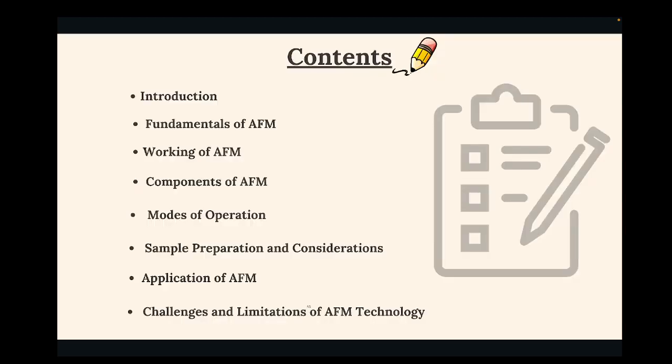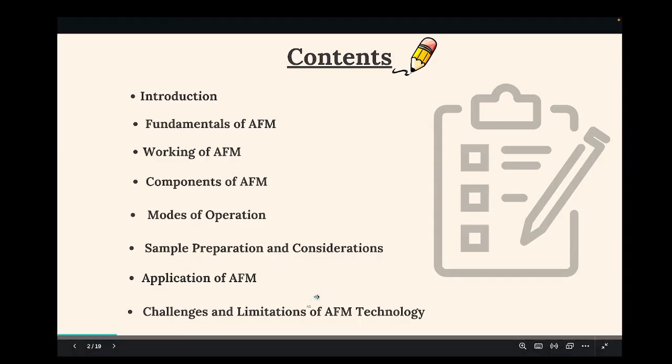These are the contents I am going to cover in the upcoming slides: the introduction, fundamentals of AFM, and working of AFM, that is, how AFM works; some components of AFM, what the important components are; modes of operation, in what modes the atomic force microscope performs; sample preparation, that is, how to prepare a sample for the atomic force microscope; applications, where the atomic force microscope is used; and challenges and limitations of AFM technology.